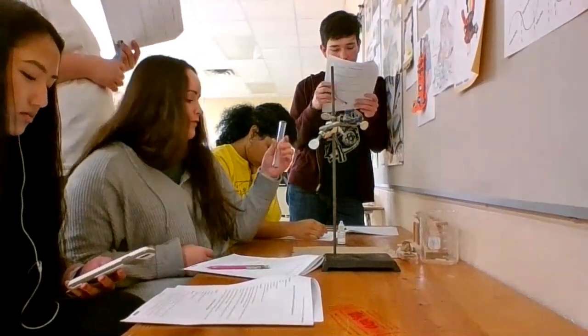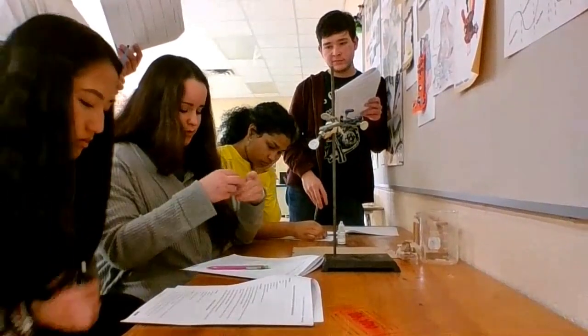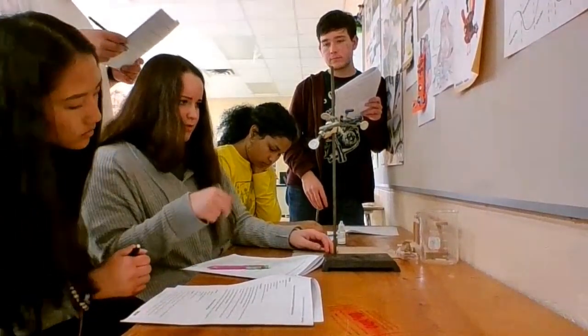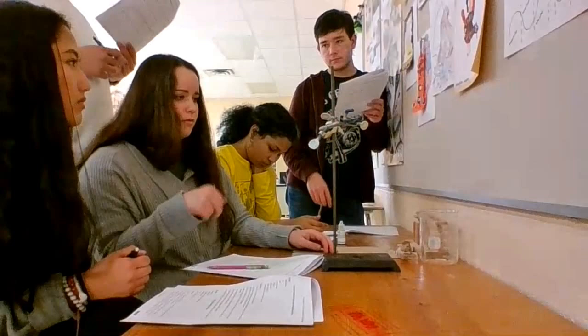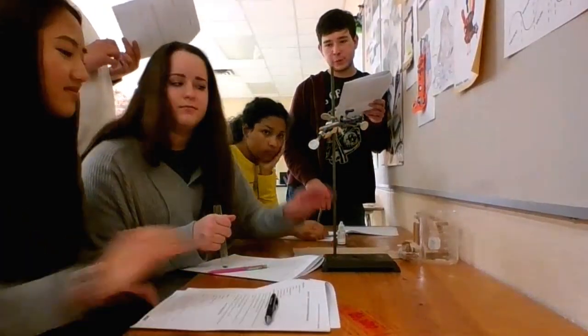What does invert the test tube mean? Upside down. And clamp it to the ring stand. Help me. Upside down. Inverted.